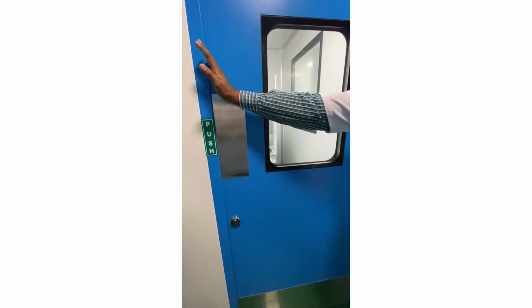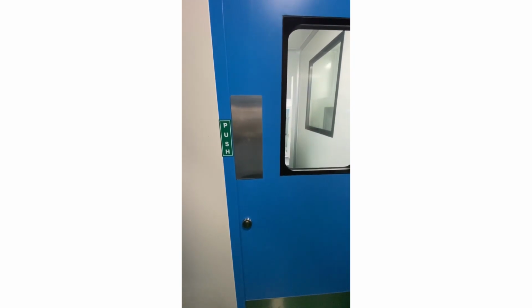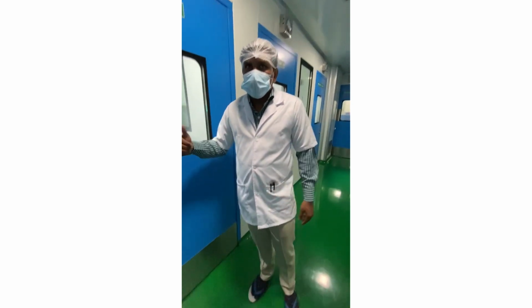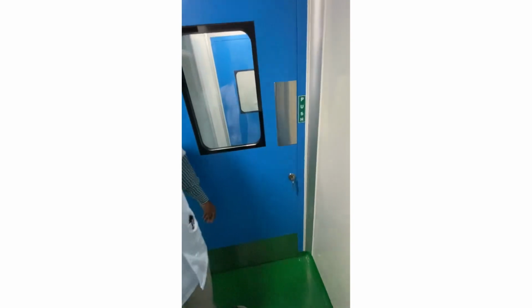You just sense here, air is coming from that room outside only. It won't go inside, it won't contaminate that room. This is the exit.